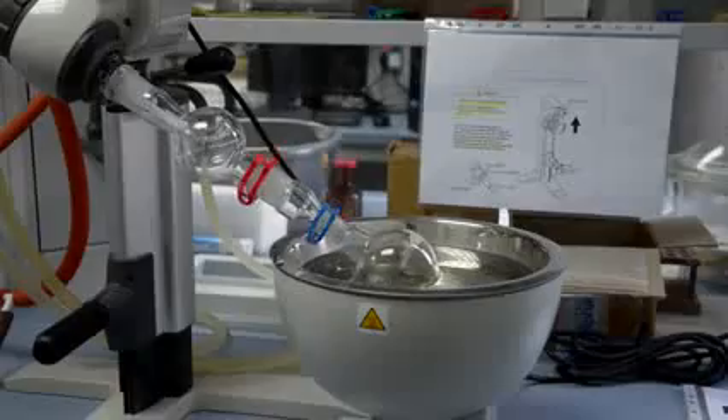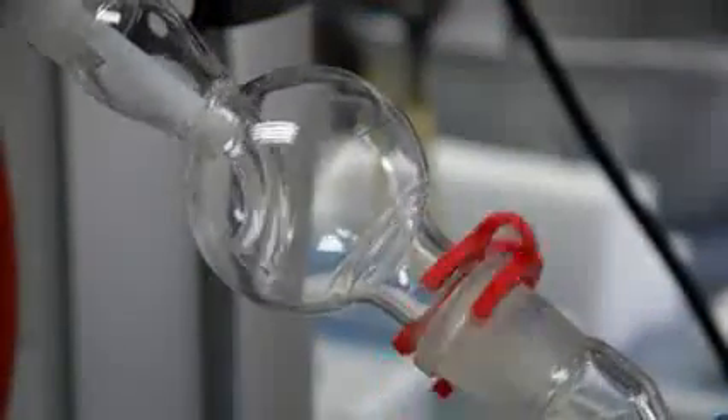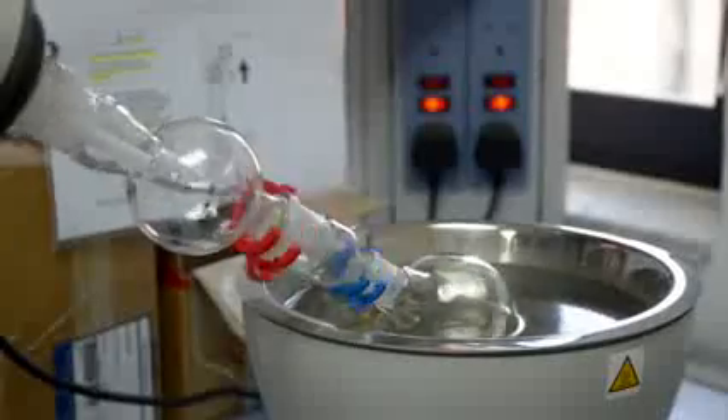Be sure to avoid too high a vacuum, as this will result in bubbling of the solvent and could cause splashing of the reaction flask mixture into the rest of the apparatus.